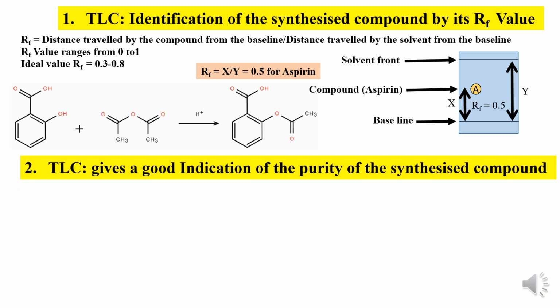Secondly, the TLC technique gives a good indication of the purity of the synthesized compound. So the purity of the synthesized compound can also be assessed by the TLC technique.